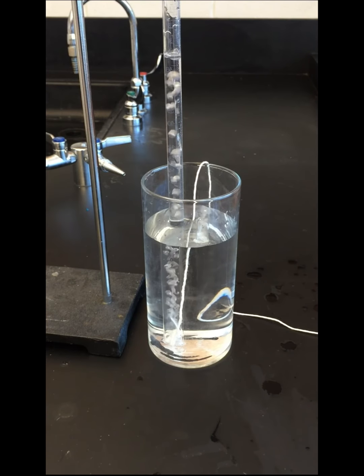As the reaction progresses, it tends to move faster and faster, until eventually all of one of the reactants is completely consumed.